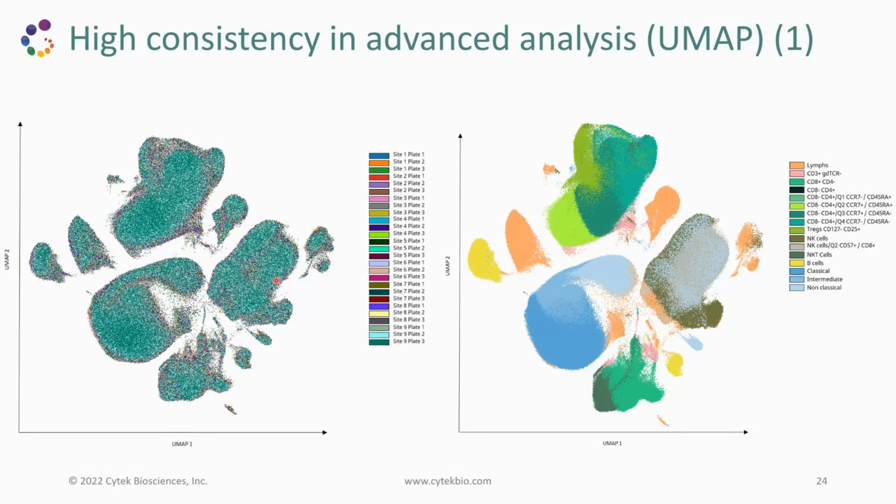And as you can see, we have an amazing level of agreement between all those data sets in each site. We ran triplicates of the assay, so at the end we have 27 data sets here that match perfectly. Here, just to show you where the different populations are. So B cells are in yellow, this island, for example. The TCR gamma delta are these cells here in pink, and our CD8 and CD4 subsets are here. So, sorry, I think CD8s are here, CD4s are here.